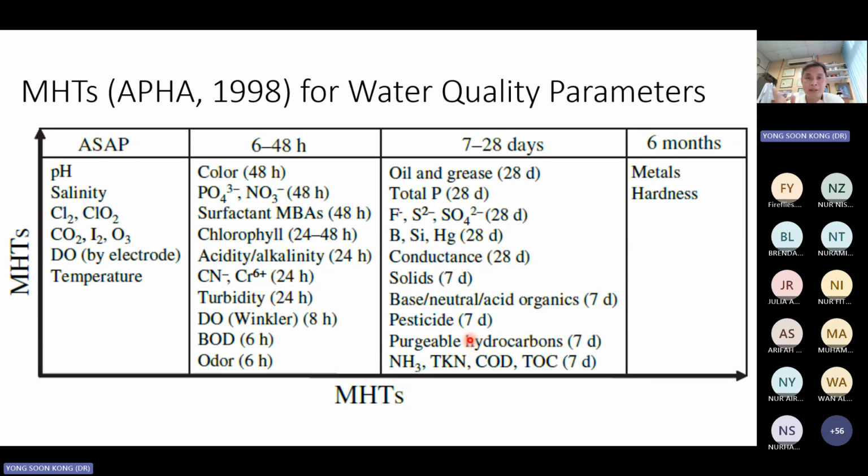How do you preserve? By the way, you still have to preserve that, even though the maximum holding time for metal is very long time. They're stable, but you still have to preserve. But how? Anyone? How do you preserve?